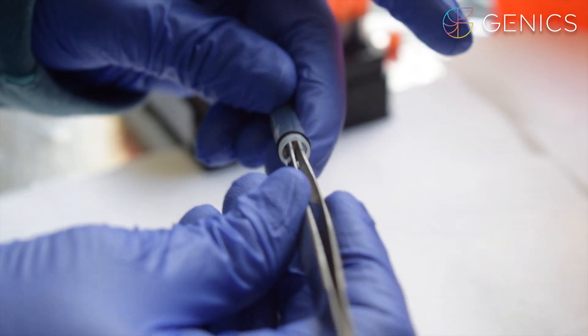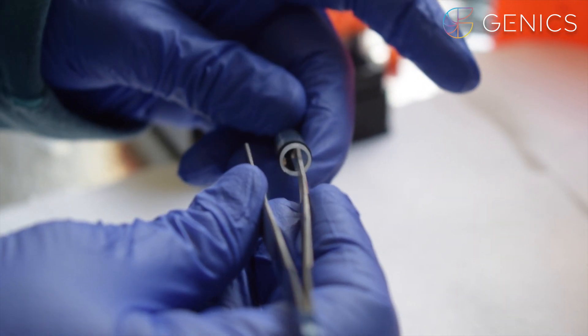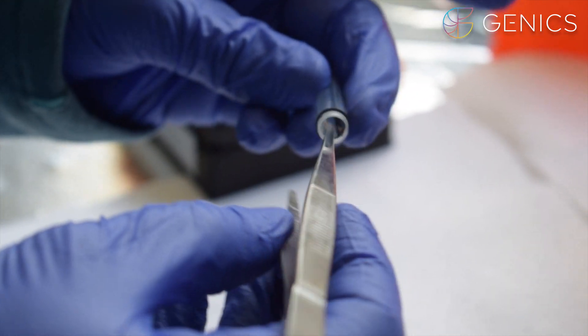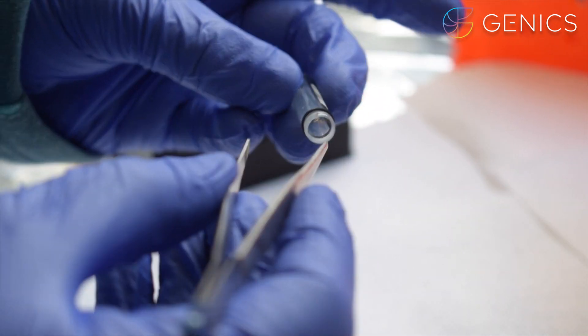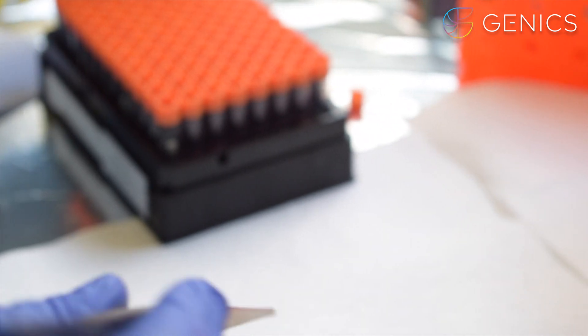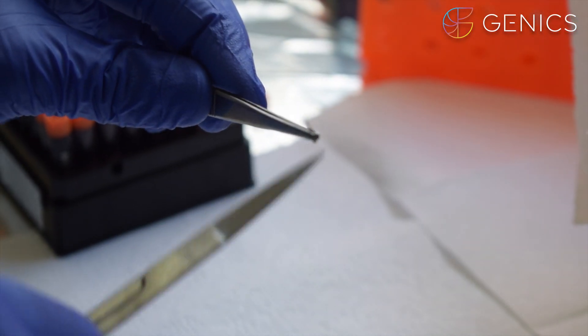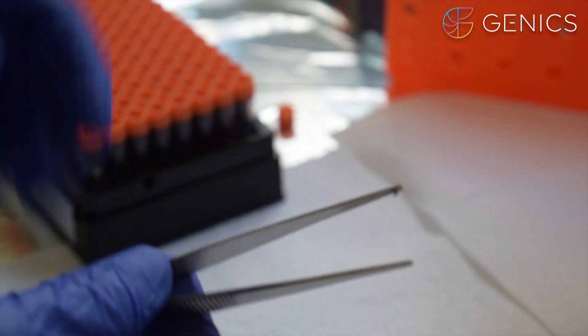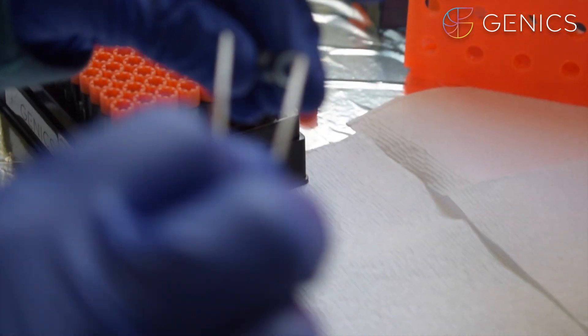But when we change tubes to make another pooled sample we do need to sterilize our scissors and tweezers and put out fresh sample equipment. If you'd like to see an easy explainer video on how to sterilize your scissors and tweezers please visit the educational section of our website genics.com.